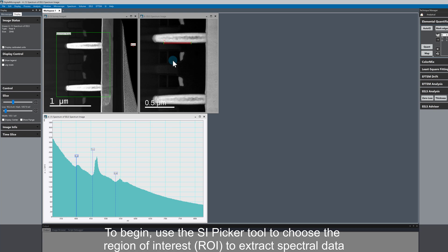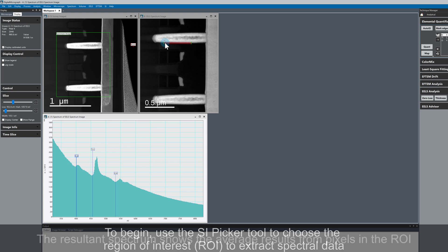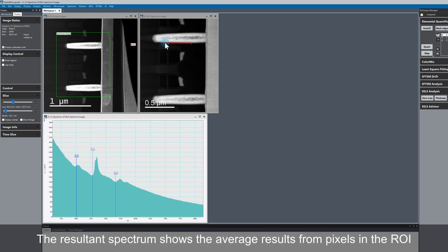Remember, we just use the SI picker tool, choose where we want to grab our data from, and then we have the spectrum here. This is the spectral data that is the sum of all the spectrum image pixels in this red box.